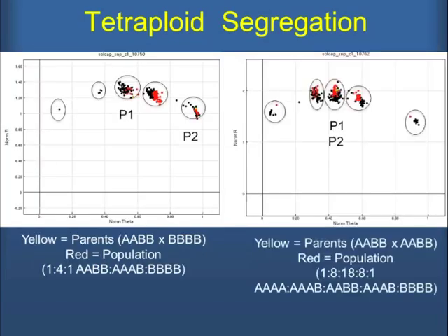So in the diploids, everything was based on a 3 cluster call I told you about. Candy went through SNP by SNP, and so she's also doing it now from a tetraploid point of view. And so what you can see here are screenshots from the Genome Studio, and what she did was color code within the full panel of material that she was working with, the tetraploid russet mapping population.